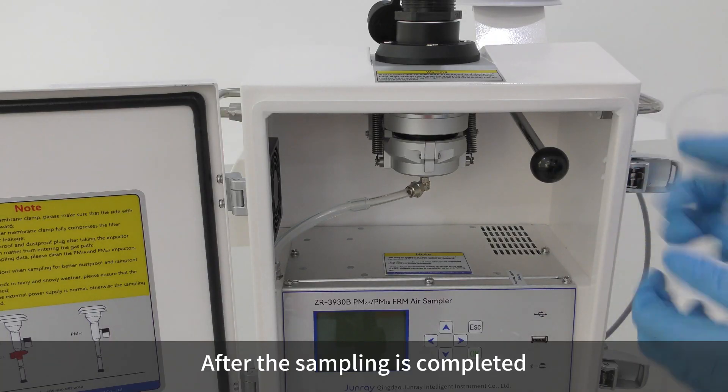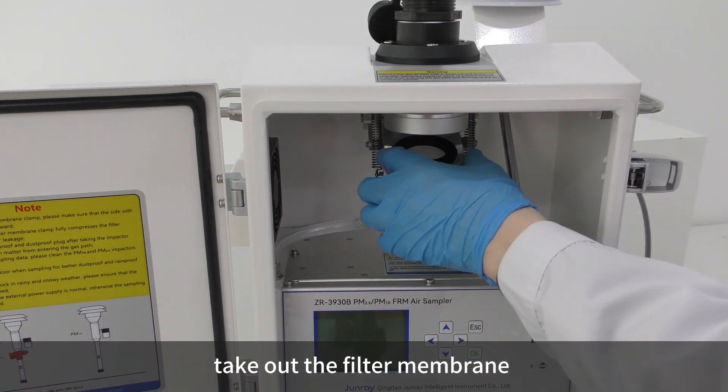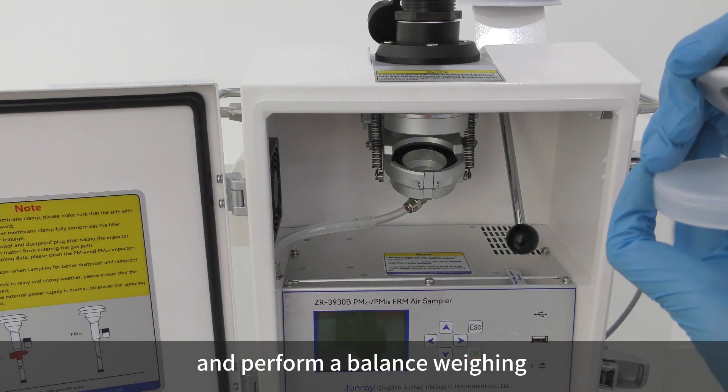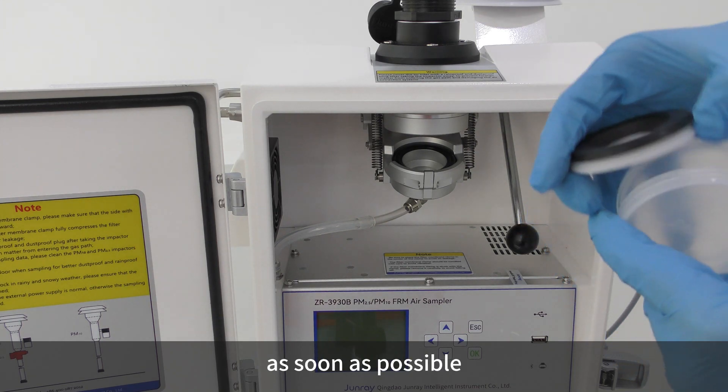After the sampling is completed, take out the filter membrane and put it into the storage box, and perform a balance weighing as soon as possible.